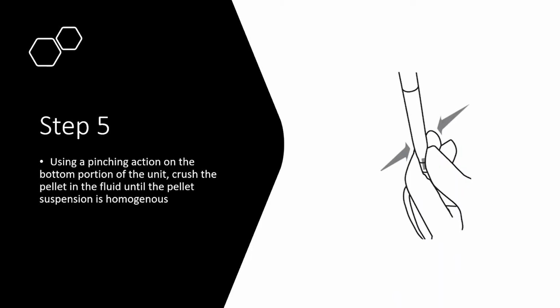At that stage, use a pinching motion to make sure that the pellet is really broken up and the suspension is homogeneous. So you really want to get the lyophilized pellet hydrated and make sure that it forms a nice suspension.